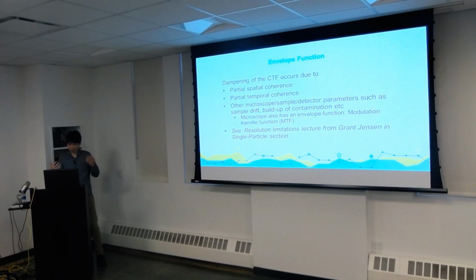Such as sample drift, you build up contaminants, you have something blocking away, and even the microscope itself has an envelope function called the modulation transfer function, which Anchi will talk about. And Grant Jensen mentioned this later on in his single particle section on resolution limitations, so you can look at that if you want to understand it better.